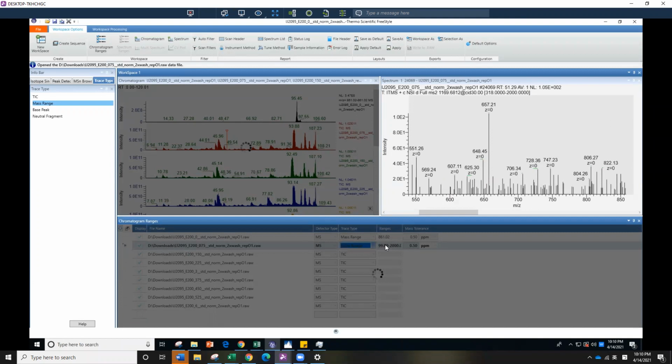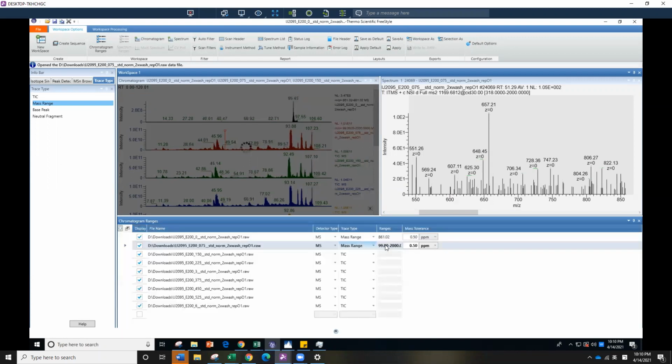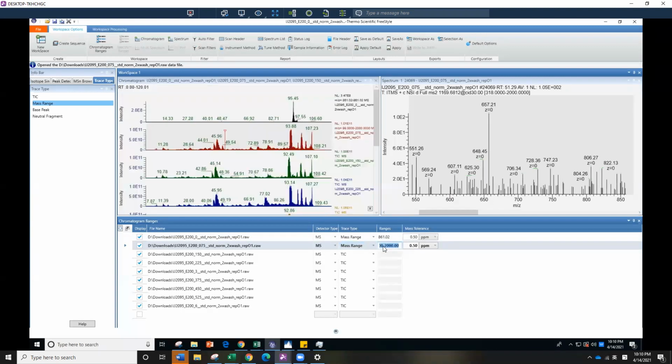I'm just going to do 2 as examples. But when you're doing it, you are going to do all 9 for one, and then we will get a quant for it and see if we can get better, and we will use those numbers to fit into CHEV and see if we can get a better fit for that particular peptide, that particular site that we are looking for. And it will be a time-consuming process, kind of. So that's why JCs will say, if we can use Skyline, that is the next thing we can try.